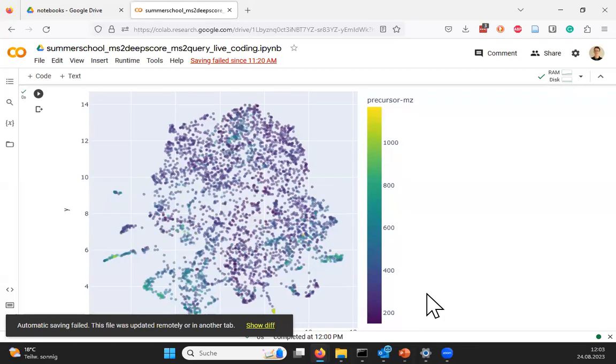I think it's good if we switch to the presentation from Justin, and then I will come back to this notebook, so you can leave it open, and show you how we import data into these notebooks and how we then use it to color these dots.